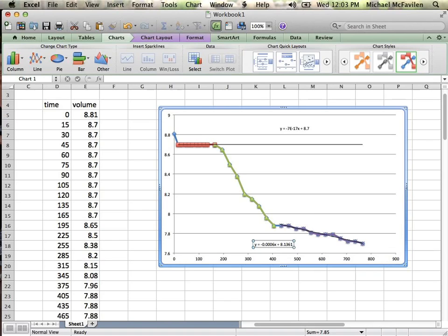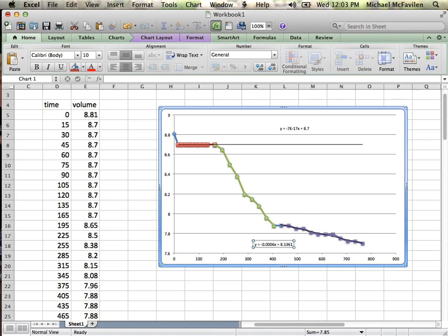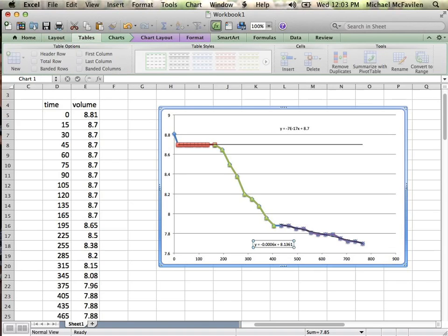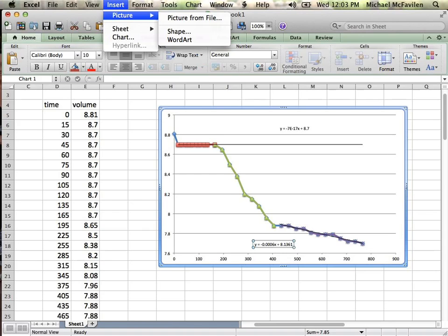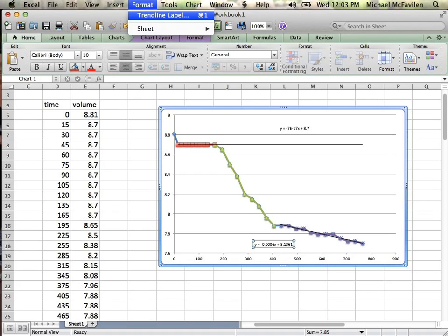Can you just draw a line? I saw it on a PC. I don't see that option on mine. I can cheat. Actually, here we go.